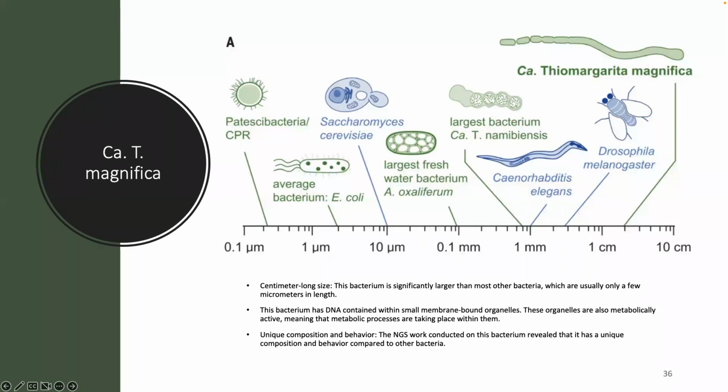And so microbial resequencing or whole genome sequencing, if you're trying to ask a question like this, what is this species? What is this strain and what is in it? How does it compare to what I know? That would be microbial whole genome sequencing.